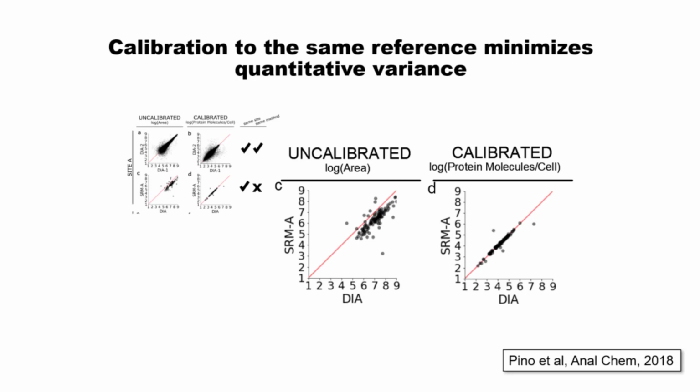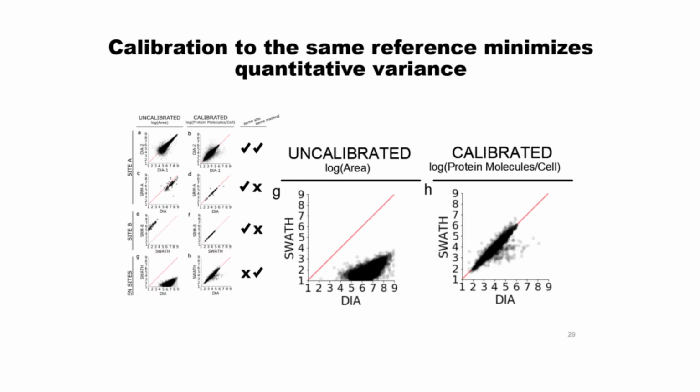Right? So then if you take her data and you measure the same peptides by SRM that the Aebersold lab did, measured compared to our QTOF data, they're fairly well correlated, but they're not ideally correlated. But then when you actually calibrate them relative to the common reference, it's much better. So we're using a single point calibration relative to a common reference material, where we've said that the copies per cell of the protein are there based on the Ghaemmaghami paper from O'Shea and Weissman.